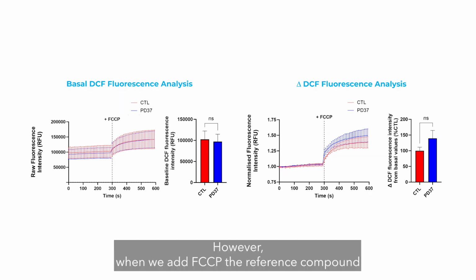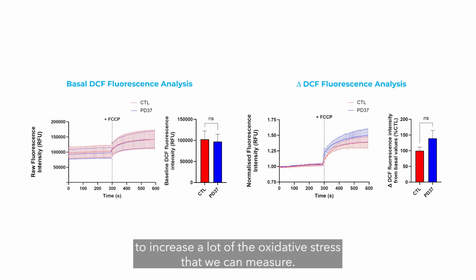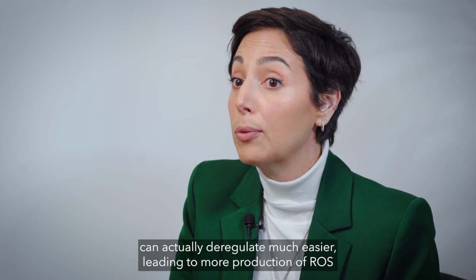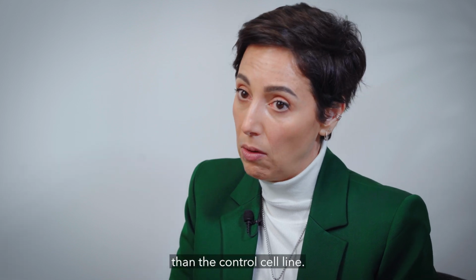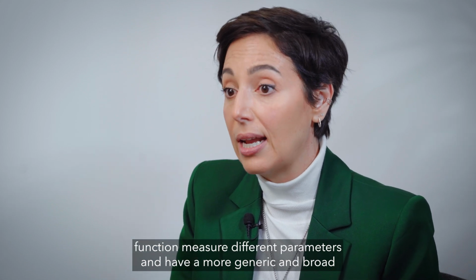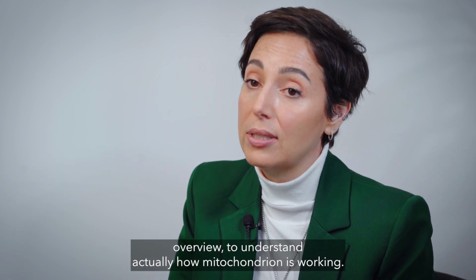However, when we add FCCP, the reference compound, in the experiments, we can see that in this aspect, the Parkinson's disease cells are able to produce or increase a lot of the oxidative stress that we can measure. This means that for whatever reason, the PD cell lines can deregulate much more easily, leading to more production of ROS than the control cell line. So again, this is why it's very important, when we're talking about mitochondrial function, to measure different parameters and have a more generic and broad overview to understand how mitochondria are working.